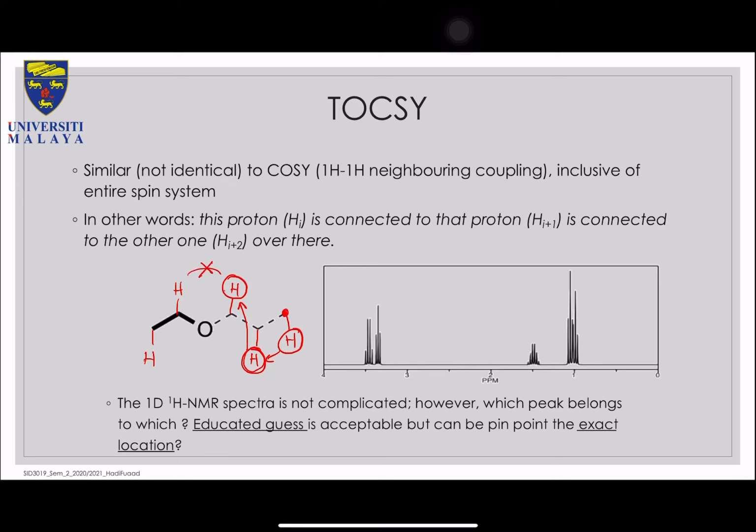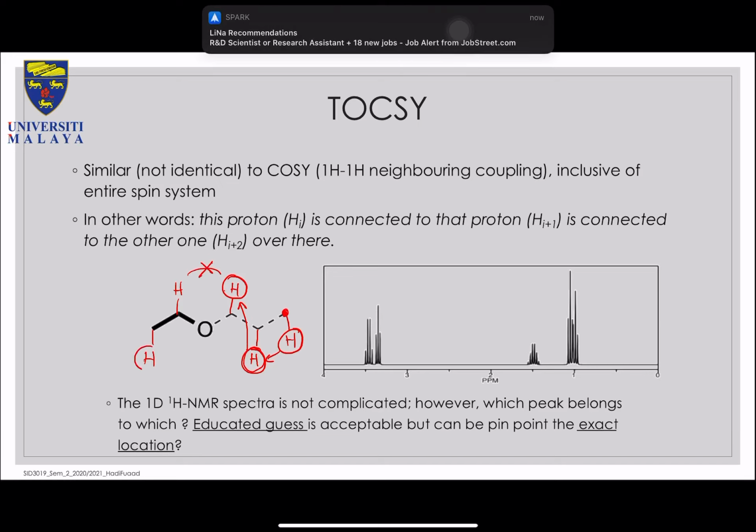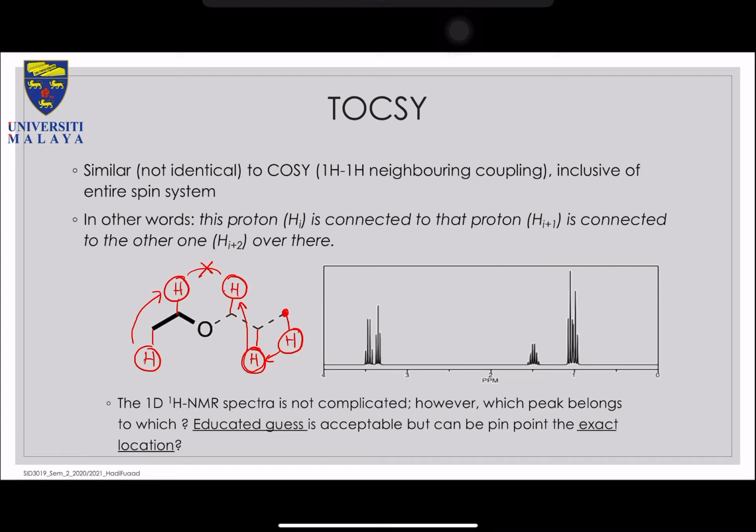So this does not happen because now the connection is broken via the ether linkage, so the oxygen in the middle. However, this proton over here can actually see the second proton. See, so this is TOCSY.